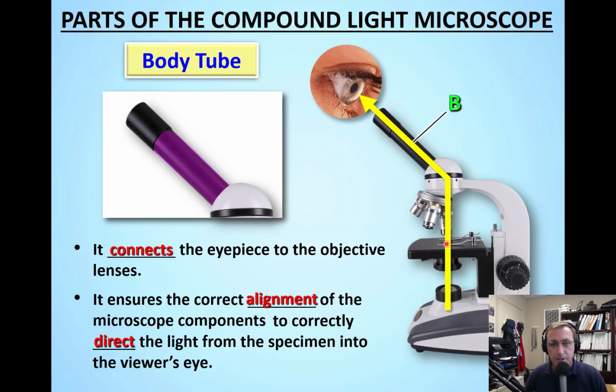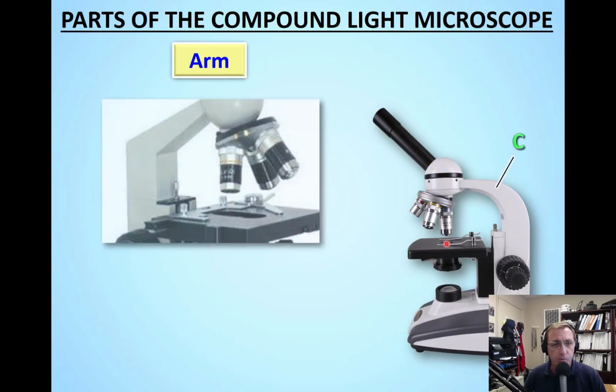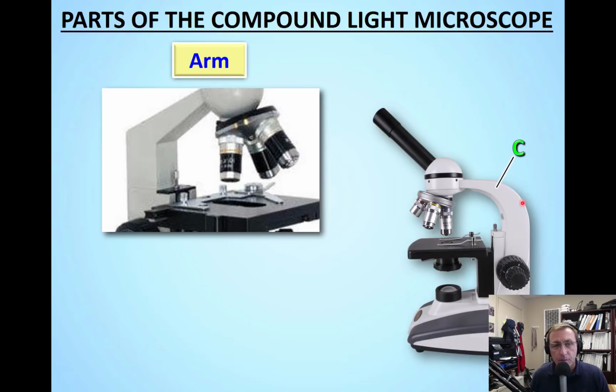Okay, here we go. Watch. Ooh, that was exciting. The light goes through the bottom of the microscope, through the stage, and through the lenses, through the eyepiece, and then into your eye. So it's traveling through several stages, but as it's doing that, it's getting bigger and easier to see, and hopefully more focused for you.